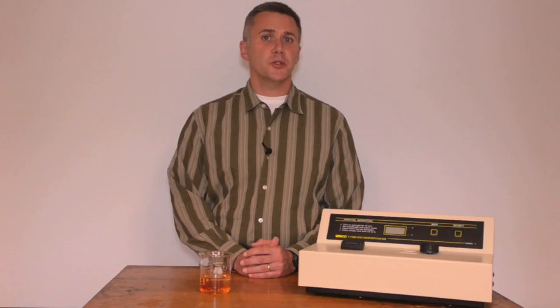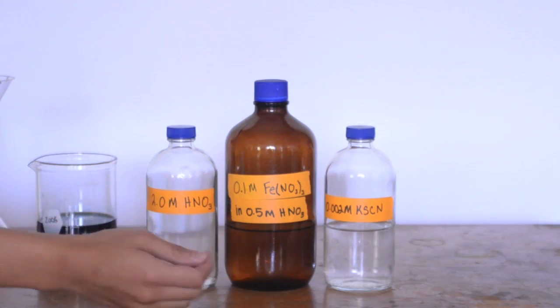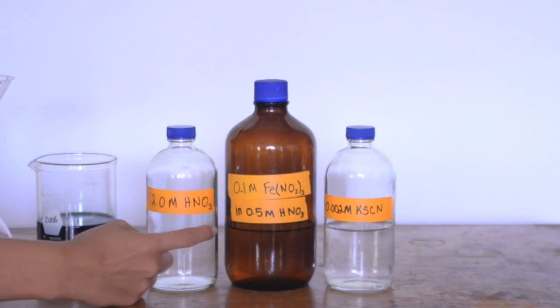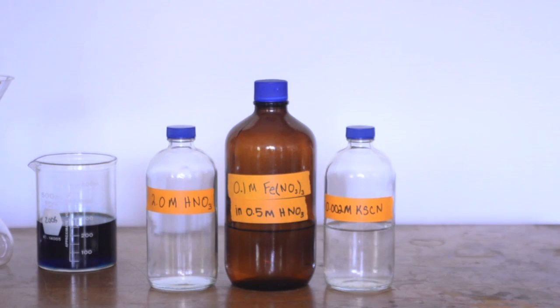Now let's turn our attention to some practical aspects of this experiment. First, we'll look at the reagents and the glassware. First, notice that there will be three main reagents: the stock potassium thiocyanate, 2 molar nitric acid, and 0.1 molar iron nitrate that is also prepared in nitric acid. Remember, the iron solution also contains this nitric acid to prevent the formation of insoluble iron hydroxide.